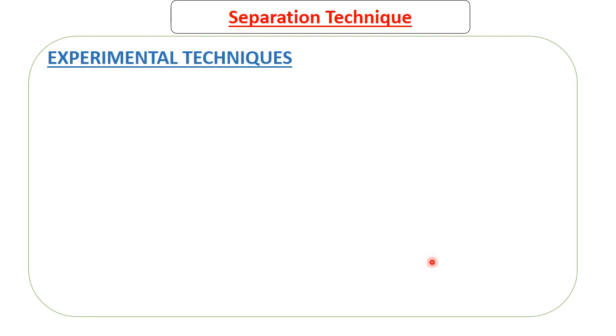So of course we need to know how to measure time, and I think we already know that we just have to use a stopwatch. A stopwatch is a watch which, if you press it, is going to start running in seconds or minutes depending on how you have set it up. Then there's also a weighing scale, which is used to measure mass. These are not difficult, but the ones that get complicated are instruments that are used to measure volume. So we're going to concentrate on that.